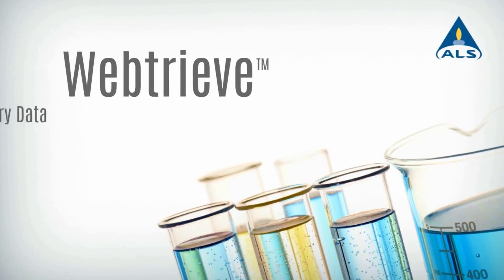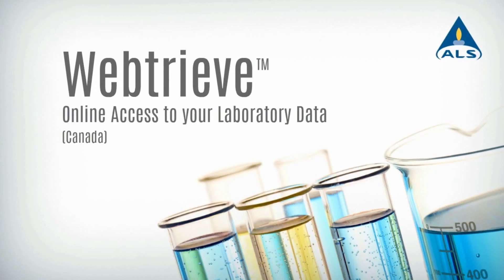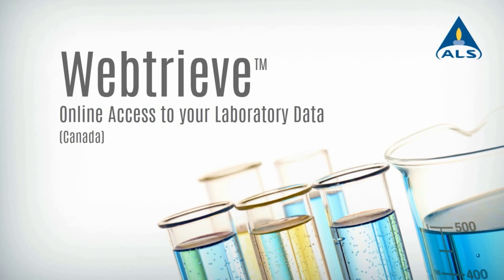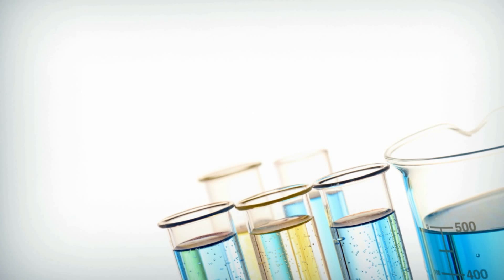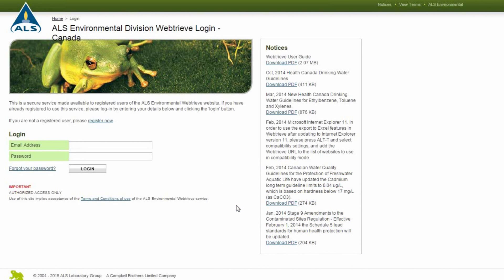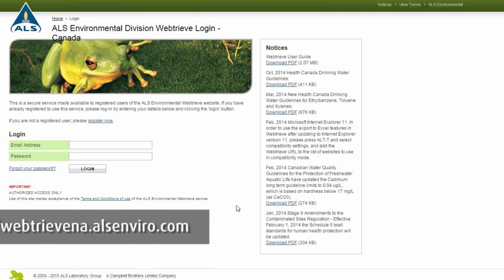Webtrieve is an internet-based application from ALS Environmental that provides real-time access to all your analytical results and laboratory data in Canada. All ALS clients can use Webtrieve.